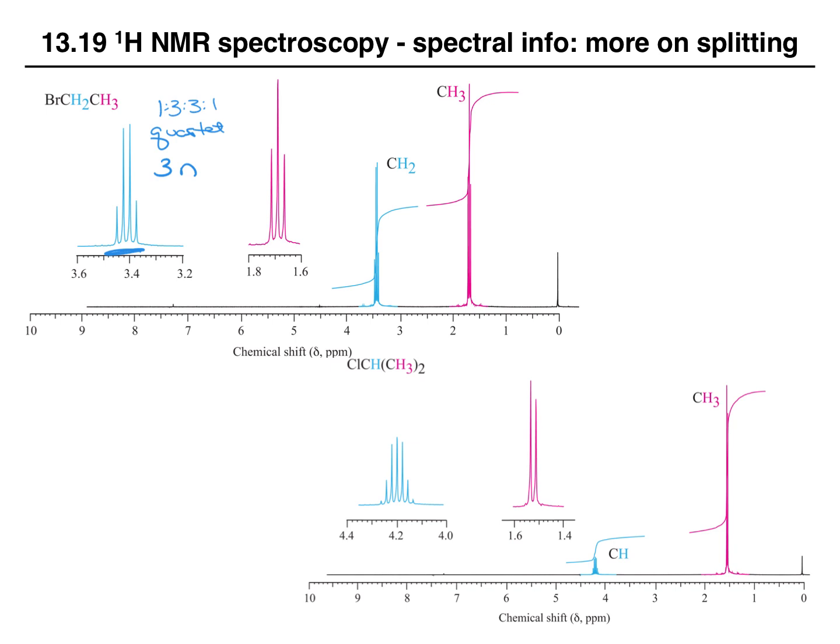Keep in mind, when we're looking at the compound and we see how many neighbors there are, we know that the number of peaks will be n plus 1. Now we're going in the other direction. Because we have 4 peaks in this signal, we take 4 minus 1 to tell us how many neighbors we have. By integration, we know that the blue signal is a CH2 group, and by splitting, we know that the CH2 group is next to a CH3.